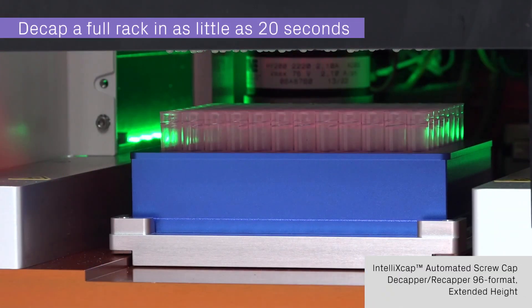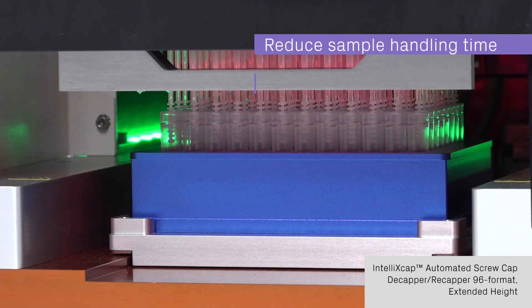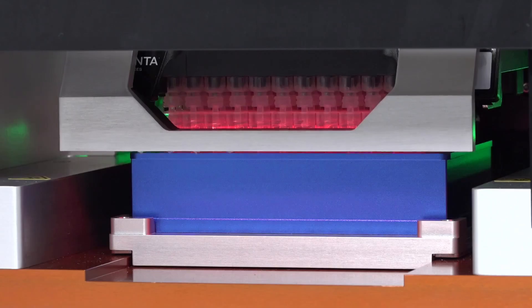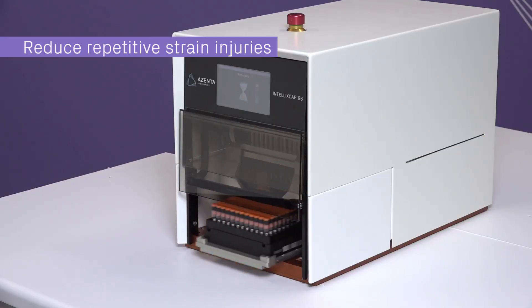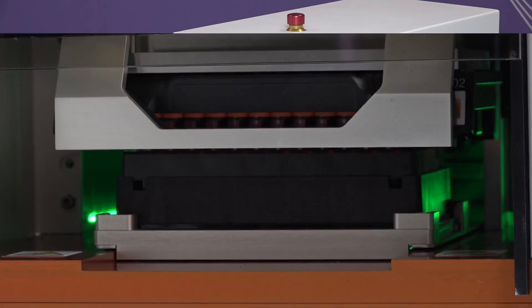Our IntelliXcap systems are able to decap a full rack in as little as 20 seconds, reducing sample handling time and increasing sample throughput. In addition, an automatic decapper will reduce the risk of repetitive strain injury for you and your team through mechanizing the decapping process.